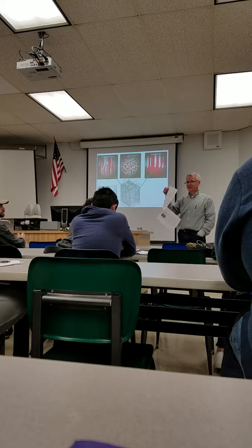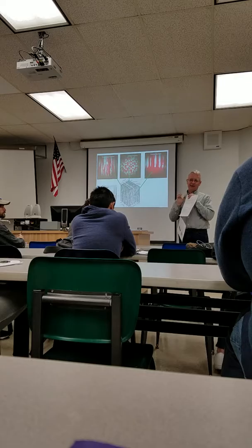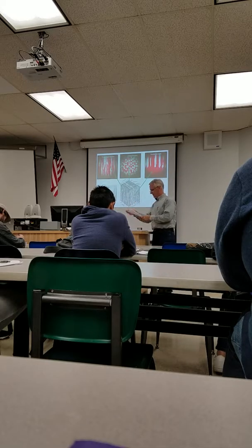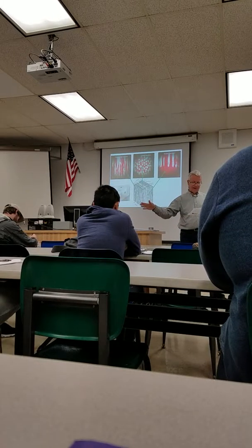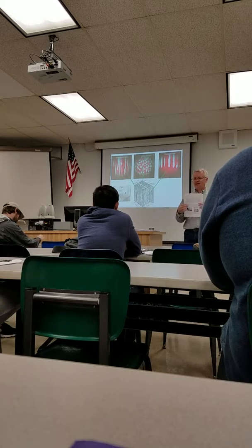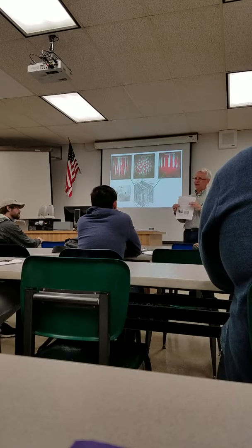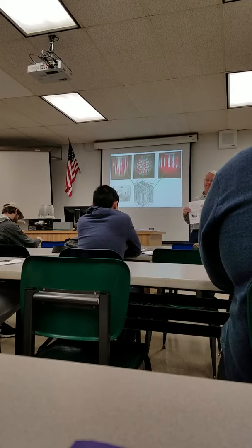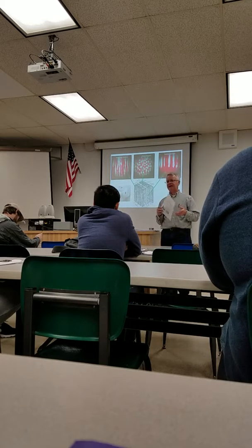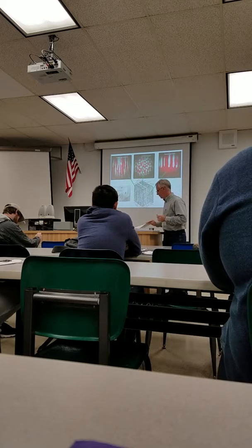So what I did was just reverse that process. I wetted the paper and broke it up so that the cells are suspended again. I've got images of some white paper and some brown paper. And I want you to speculate about what types of wood went to make the white paper and the brown paper, and why that might be the case. Use what cell types you see to make a guess about what wood types went into that kind of paper, and then talk about why maybe they chose those.